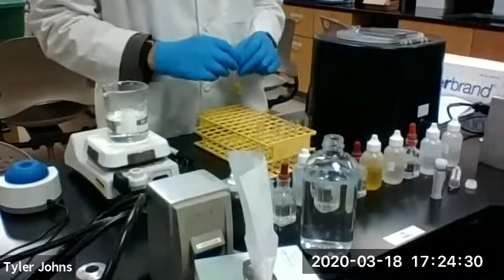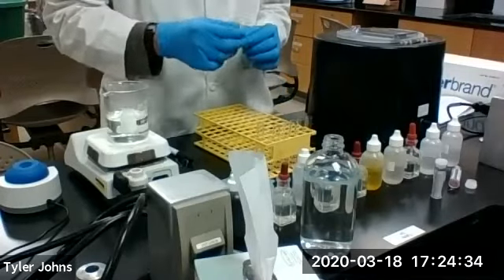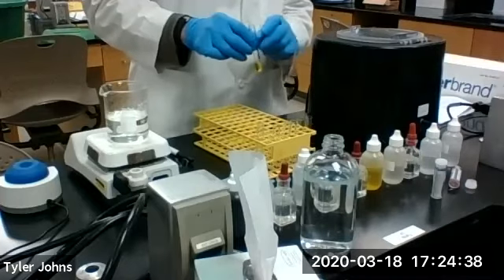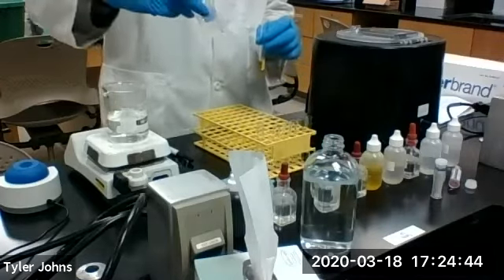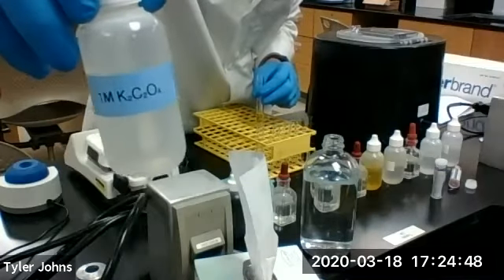Okay, we're now going to be testing for the presence of the calcium ion. We're going to be taking solution 15, S15, and we're going to be adding 10 drops of 1 molar potassium oxalate. Here's our 1 molar potassium oxalate.